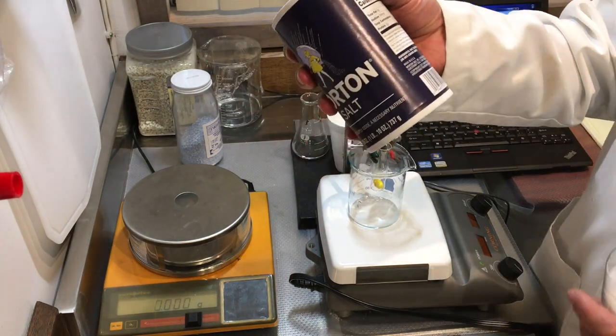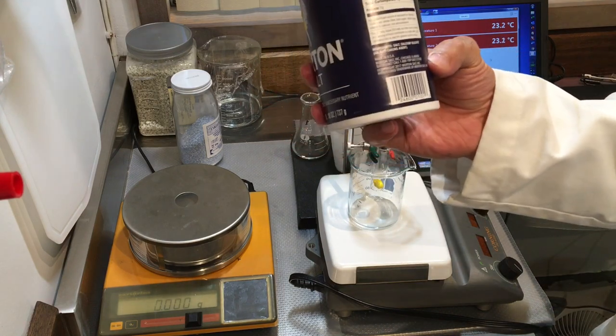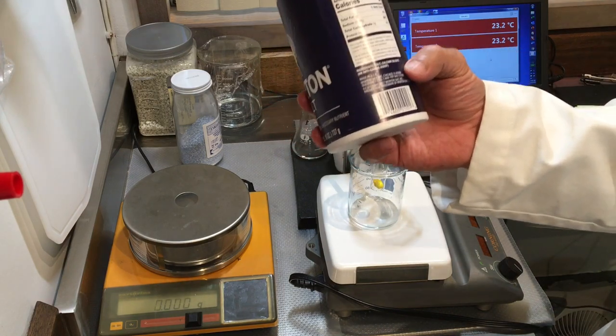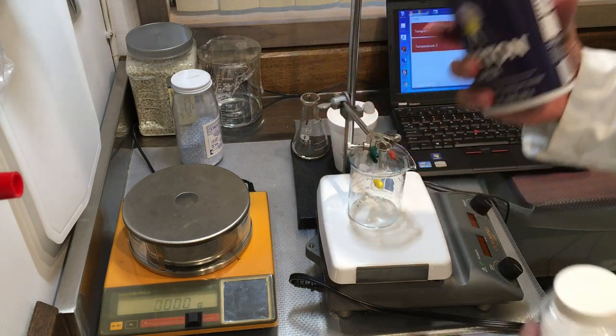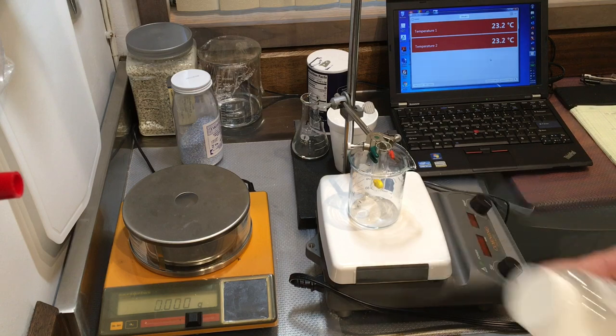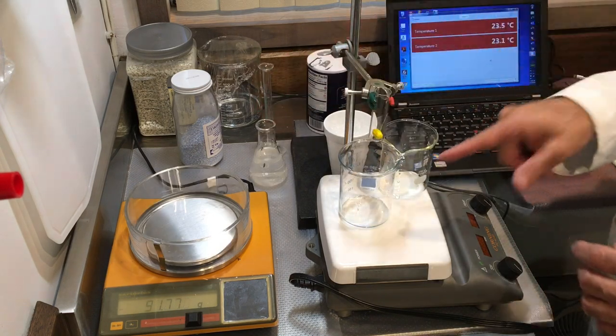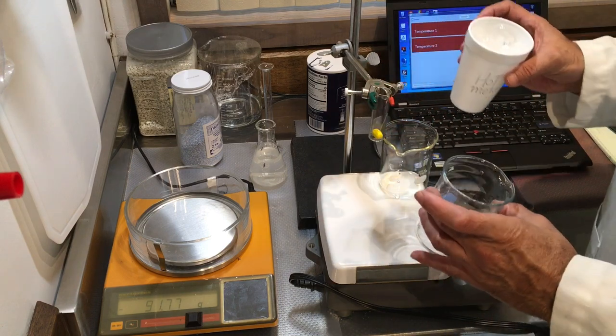When you dissolve the commercial salt in water, you get a hazy looking solution because the calcium silicate is insoluble. So I'm going to use the pure sodium chloride salt. Let's go ahead and get my ice-water-salt mixture ready.